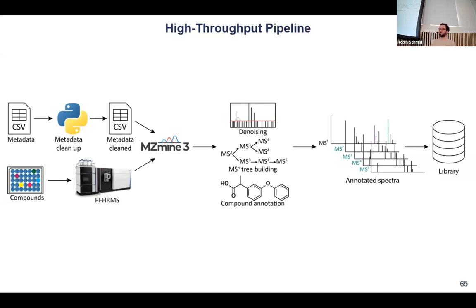And once you dissolve them, they're no salts anymore. And also when you measure them, you're not going to see something like tartrates, you know? So we really had to clean up the structures, harmonize them, calculate the neutral masses, and then we can plug all this into MZmine. And we can also produce an acquisition list.